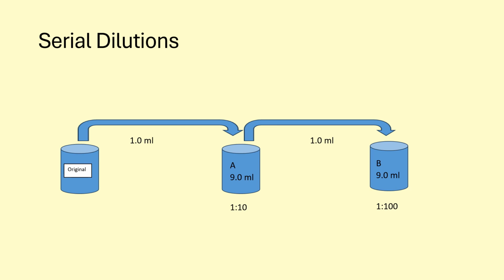So if you were to take a sample from B and plate it on a petri dish, and there's other videos that explain how to do this and how to do the calculations and all. But if you took a sample and you plated it and the number of colonies fell within 30 to 300, you would use that sample. And when I say you relate the usable number back to the dilution factor, this is the dilution factor. So let's say you did take a sample from here. You took 1 milliliter, you put it on a petri dish, and let's just say you had 35 colonies.